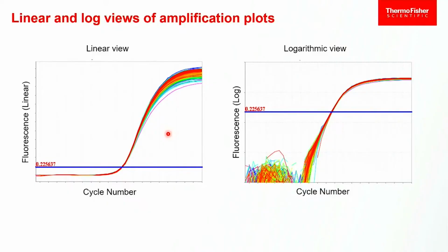You can see both. Typically, the default view is going to be the log view because we want to use it for quantification, so we're typically going to present that to you first. But you can see both.